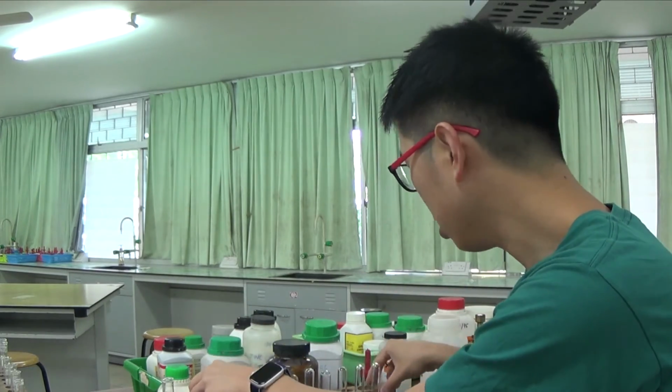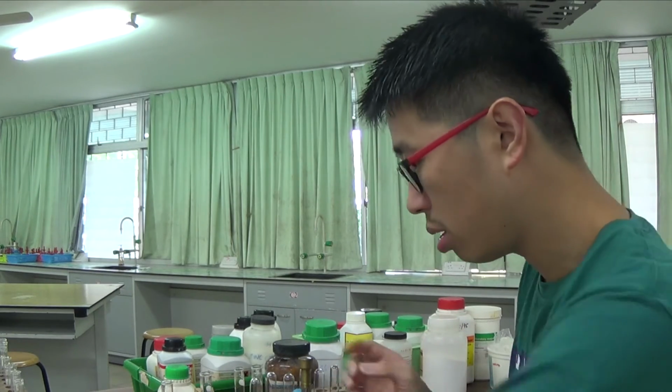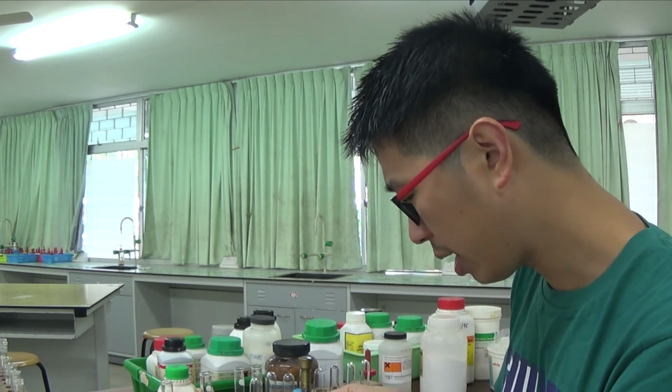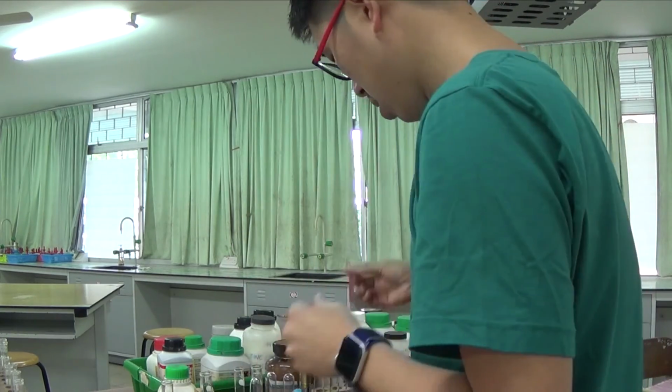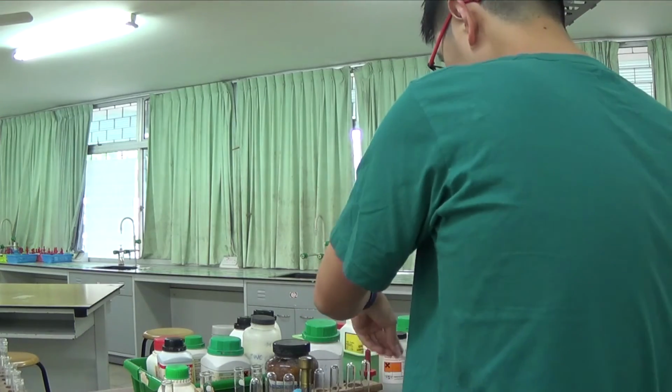So I'm just going to heat it. So back to Bunsen burner. Make sure the air hole is closed. Just want to prepare my red litmus paper so that I can test for my ammonium ions. I want to moisten it with some distilled water.